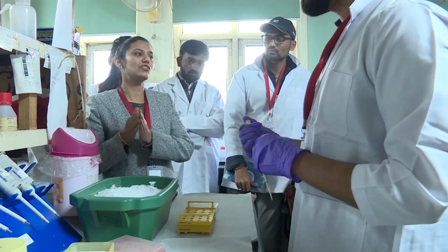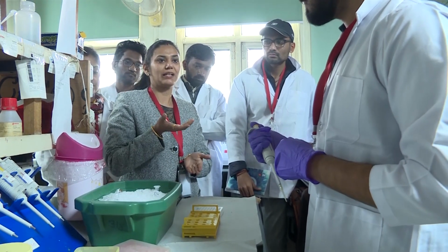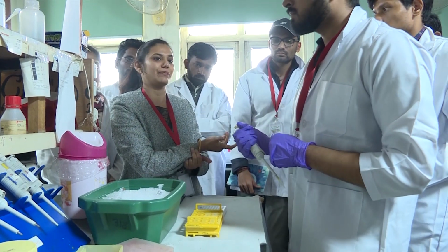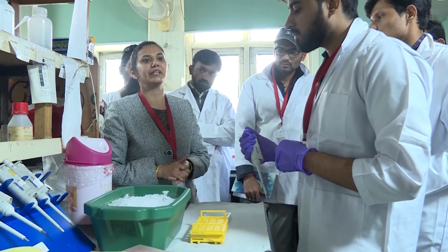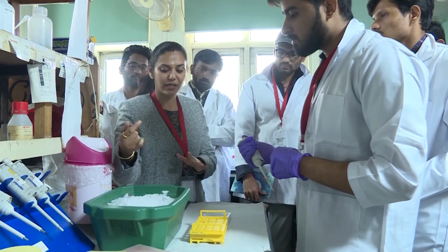For MAP kinase, you have to use MAP kinase primer. For the sample cDNA, for your control you have to take cDNA prepared from the control sample, and for treatment you have to take cDNA prepared from the treated sample. So that will be variable.